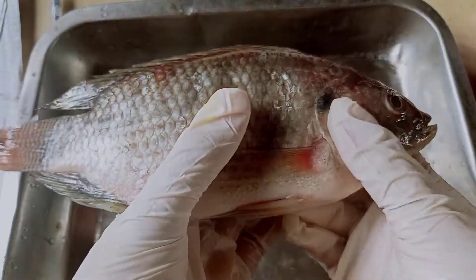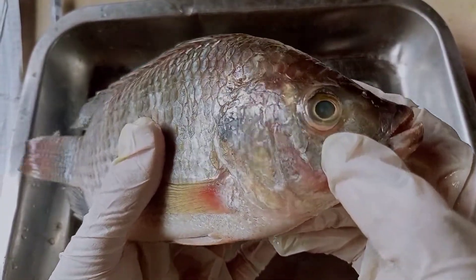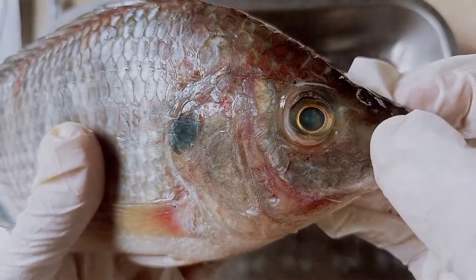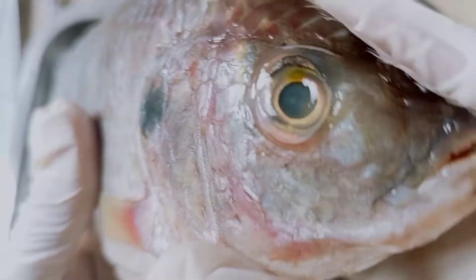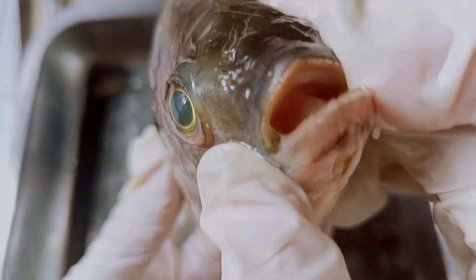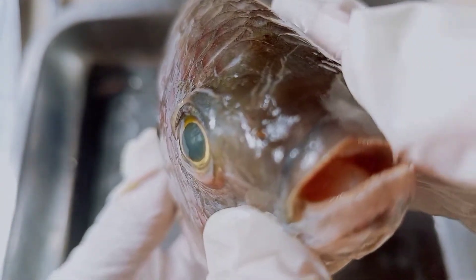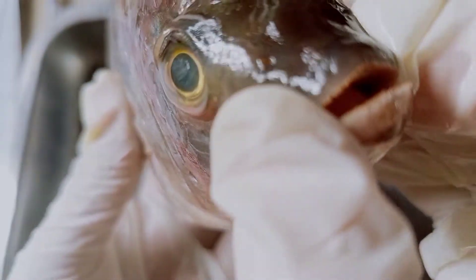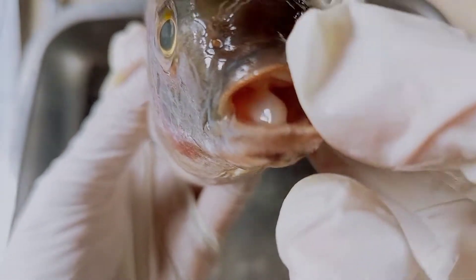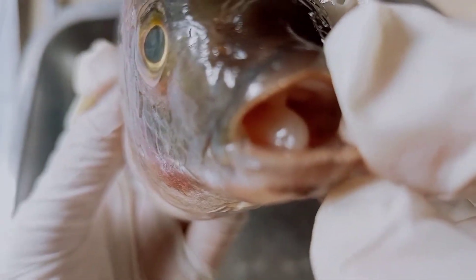So here on the head, we can see their eyes and their nostrils — they are quite small. And here on the mouth, we can see their maxilla or the upper jaw, and the mandible, the lower jaw — that's the one on the bottom. And inside, we can also see their tongue.